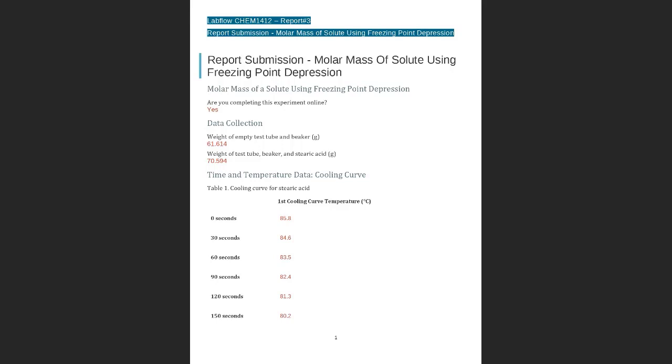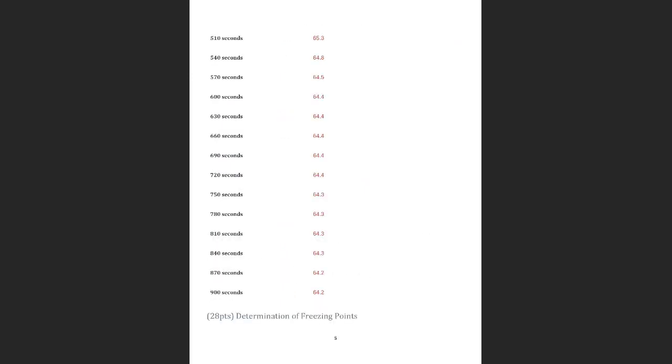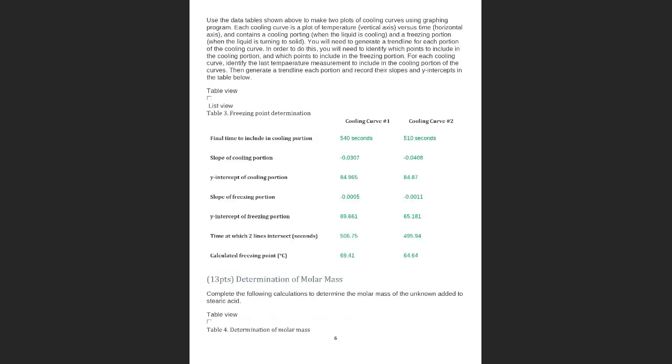And they are going to give you lots of data. This is how it's going to look. You will have to plot all that data in Excel.